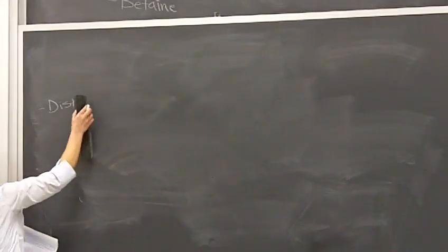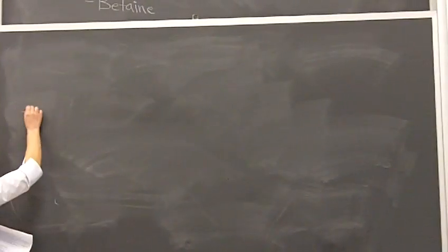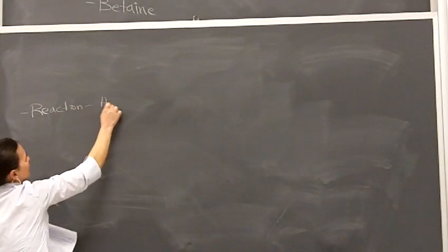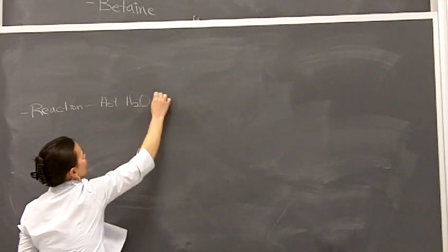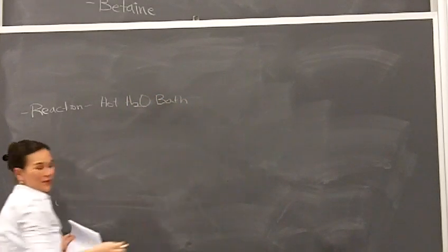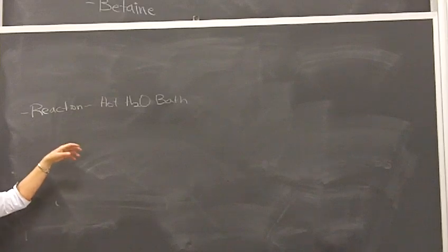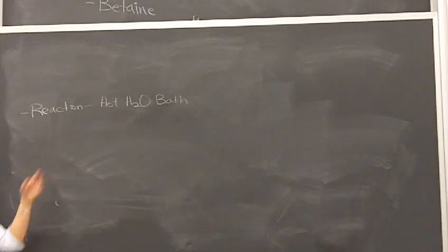Actually, here, I'm going to back up a little bit. The reaction you're going to do in a hot water bath, so you're setting this up for the TAs to watch and make sure everything goes okay for you while you're learning how to process NMR data. So make sure you put enough hot water in there that it's going to last for an hour or more of refluxing, okay? So you're using a hot water bath. Do not use a heating mantle. Use enough hot water and use hot tap water so that it gets refluxing right away, okay?